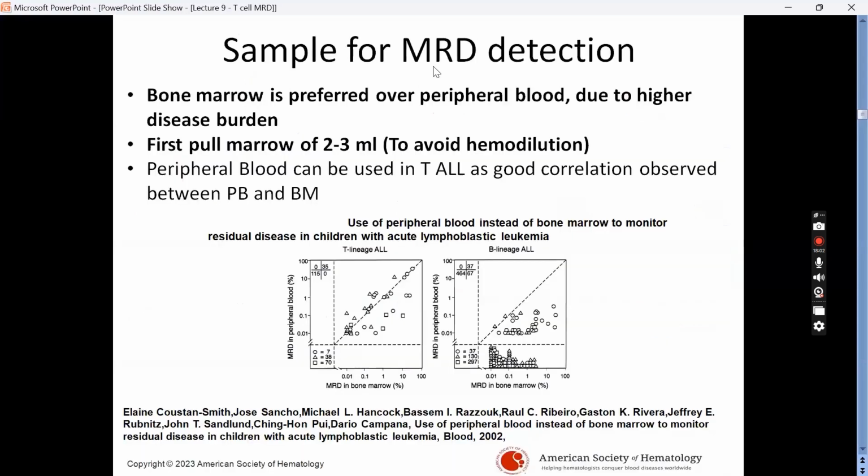That's fine. But the most important catch in this case, so this case was given to you to discuss about gamma delta T cell malignancies, which I didn't cover much during our theory session, or I didn't show you a case during our live gating also.